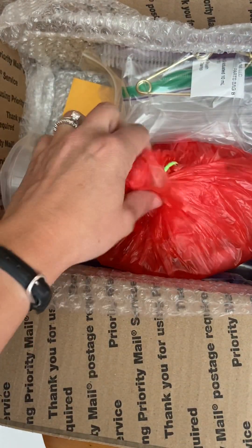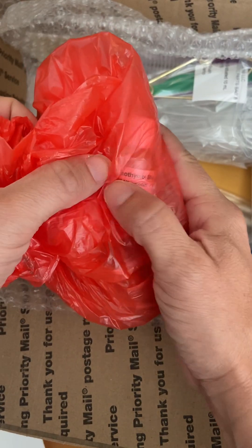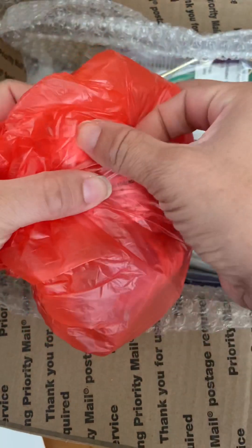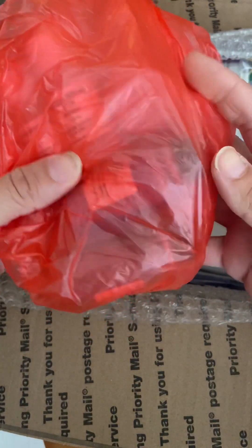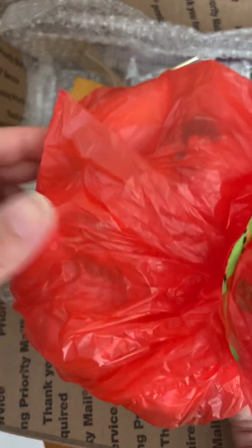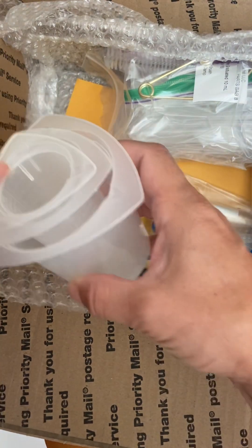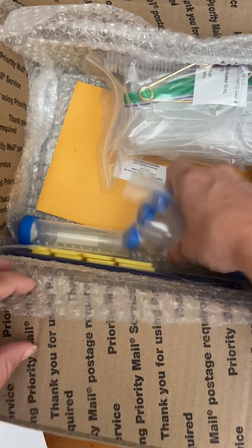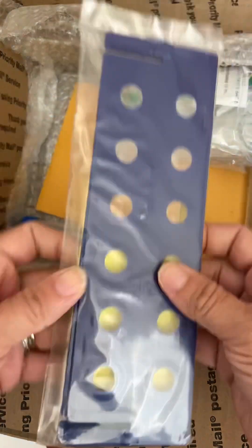In here we've got more chemicals — we've got bromothymol blue and barium nitrate — all in a separate container. Normally I would open this up, but it just looks like it's going to be increasingly difficult to put back in. Then you have your measuring cups and test tubes.